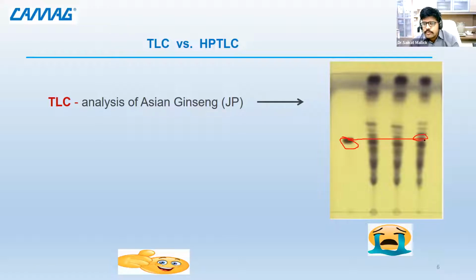So whether this is the spot which the sample has, or it is the lower spot, seeing the intensity, I feel it is lower, but whether it is the same thing, we don't know, because of this variation which is happening. There is no resolution. If I want to see whether these two spots are different or the same, or just because I'm getting some intensity increase over here, I cannot rely on whether they are separated fractions. So although I'm doing an experiment of that value, putting in so much effort, what I am expecting is a good result, which I am not getting from this.